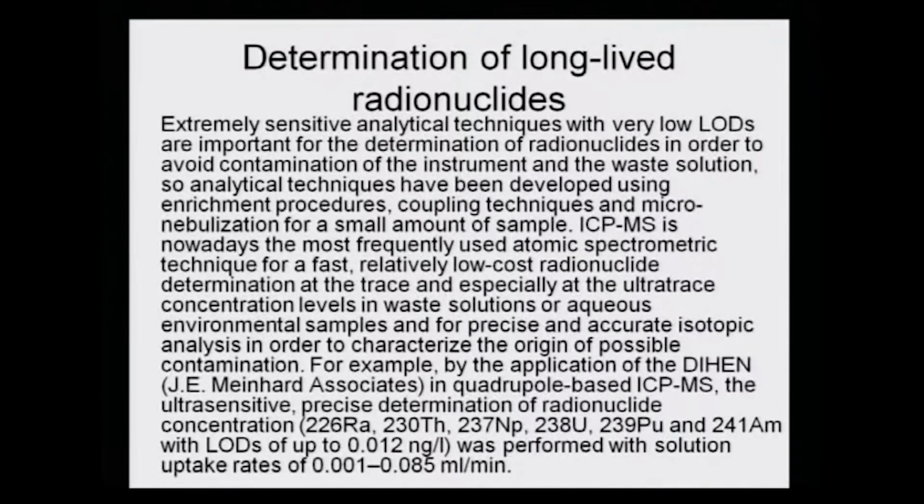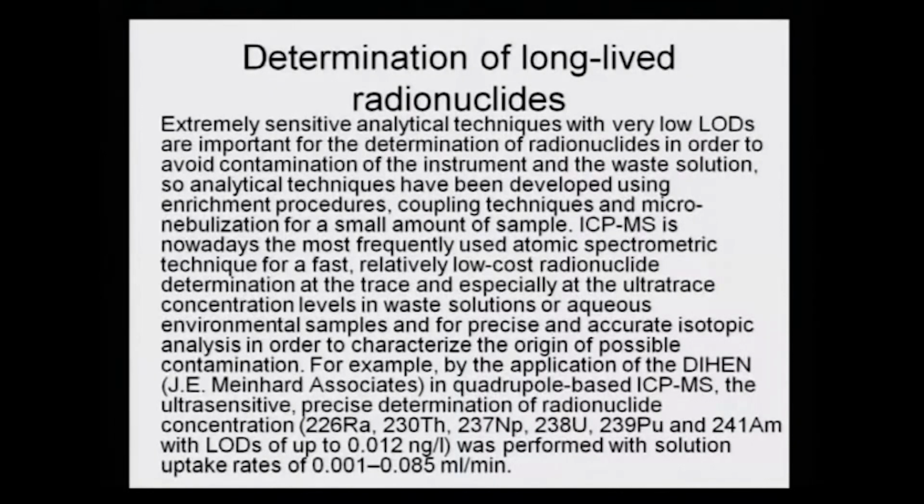Now, one thing has to be kept in mind, that radionuclides are not like any other analytical element. Even their waste has to be properly disposed, and designing a method for the analysis of these long lived radionuclides is slightly different from the existing methods. That is why more precaution needs to be taken. It has to avoid contamination of the instrument. The instrument cannot remain with that nuclide. So, proper washing and proper removal has to be kept in mind, and the waste solution that is generated after the analysis also must be quite properly disposed.